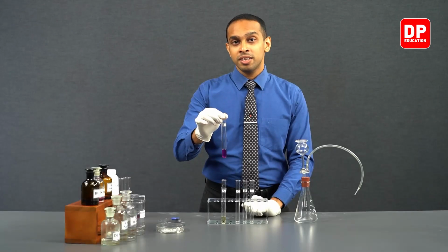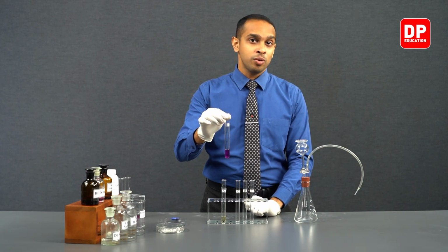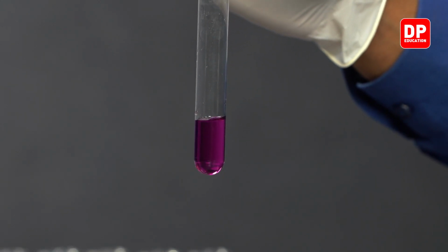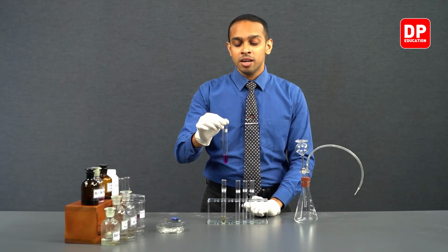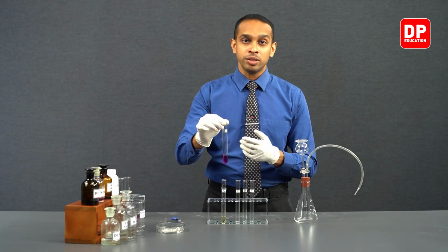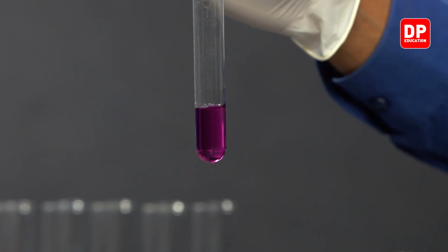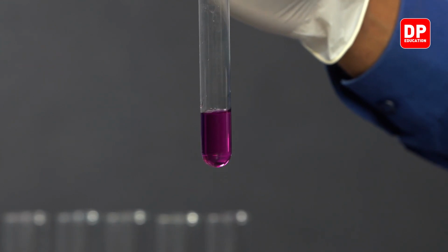Students, the reaction of dilute potassium permanganate in alkaline medium with any unsaturated hydrocarbon is also referred to as the Baeyer's test for unsaturation. So this particular test will provide you a positive answer if the purple color seen here in alkaline potassium permanganate turns to a brown color, producing a brown color precipitate, which is MnO2.